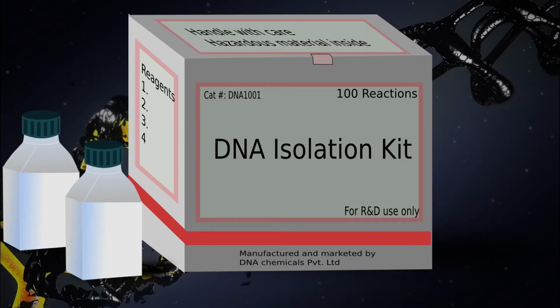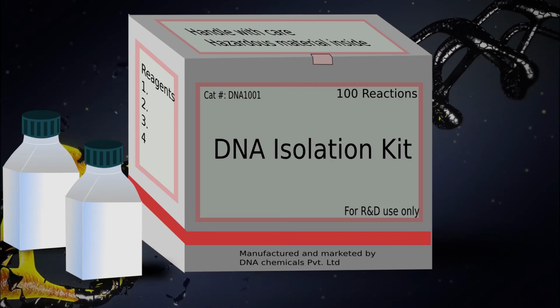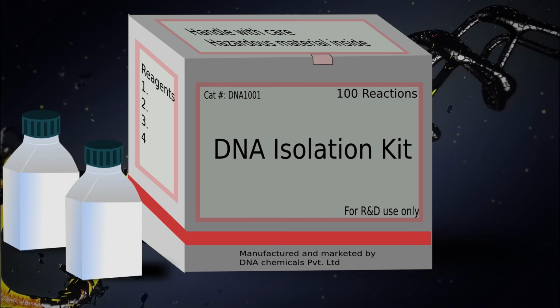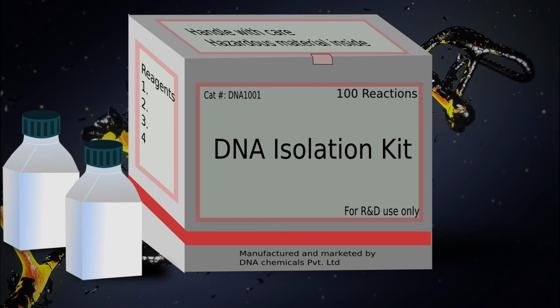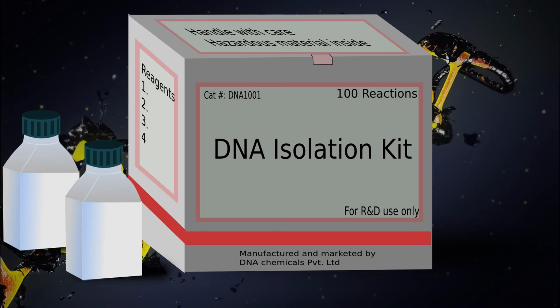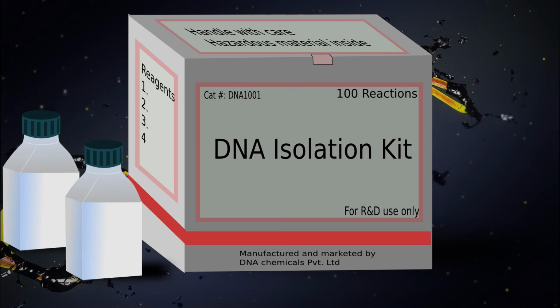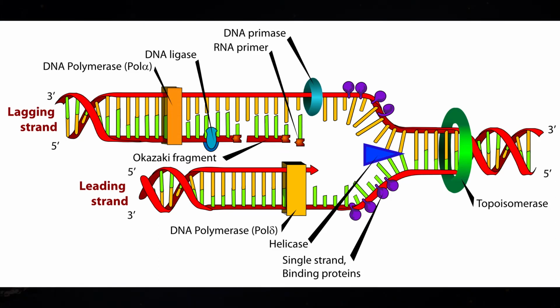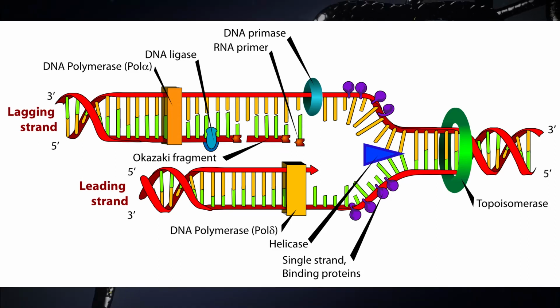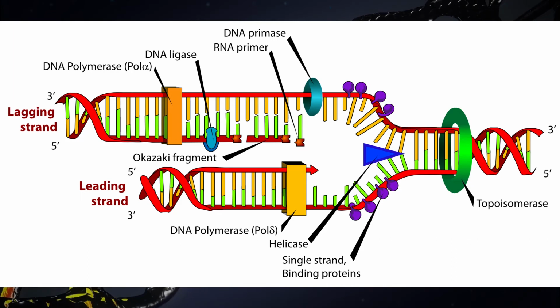GC-rich PCR is another version of PCR yet again. Like the others, it's designed to be more refined and specific, and in this case, it uses a variety of polymerases, and these polymerases allow for unique, particular delivery of certain templates. Now, some templates, particularly if we're talking about those that are based on a primer sequence that's ubiquitous, have a lot of difficulty in targeting where they should be and how they should be.